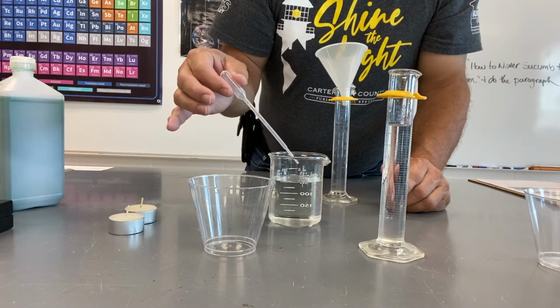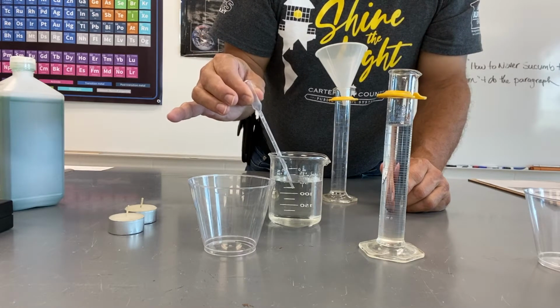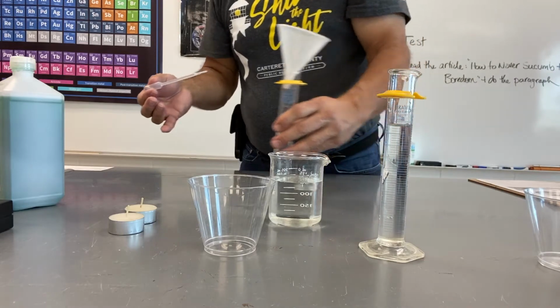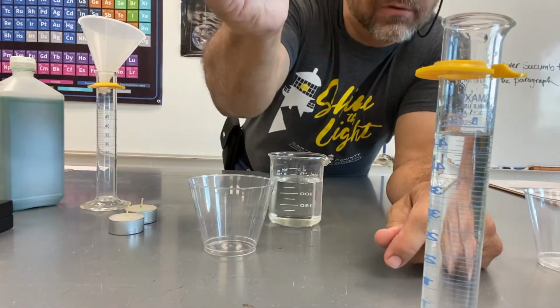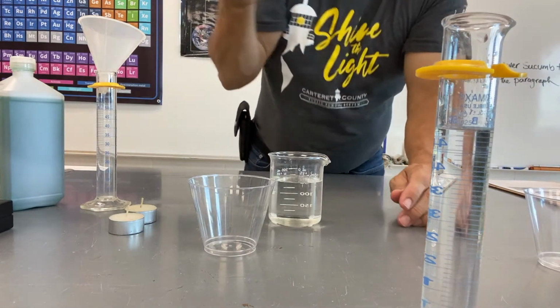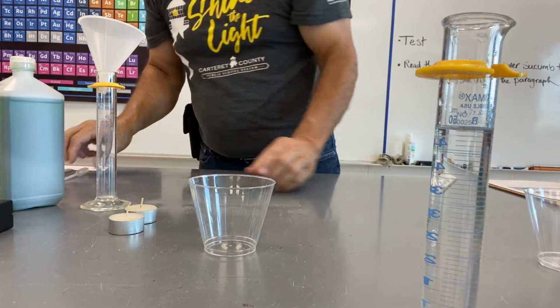So the way you use these, if you've never used one before, is you squeeze it to take the air out, put the tip in the water, and release the bulb up here. So I'm not squeezing anymore, and that sucks the water up. And then, let me see if I can get to our 50 without going over here. There we go. All right, got it that time. Clear the rest of the water out of this in case I need it for alcohol.